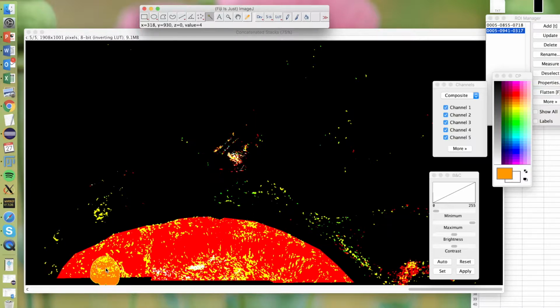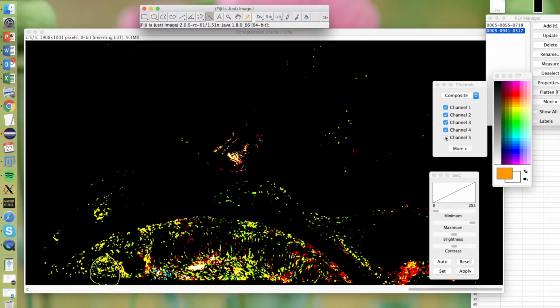Okay. Now how are we going to get the other stuff out? Let's turn this channel off so you can see the cells more clearly. Remember, you can just turn them off and on, it's fine. What we want to get is two shapes that we can put straight over to fill them in with the other colors. And what's the cutest way to do this?